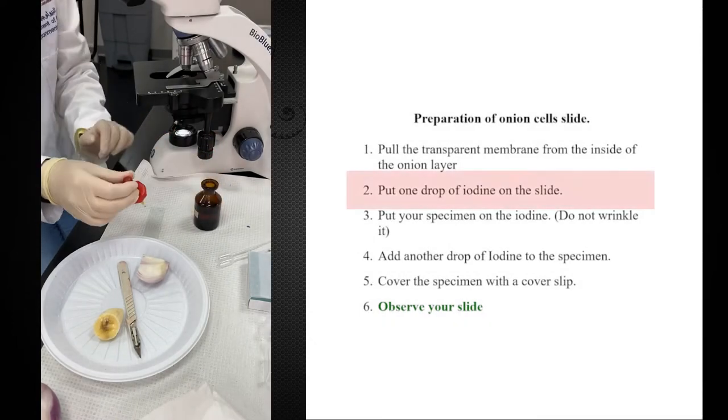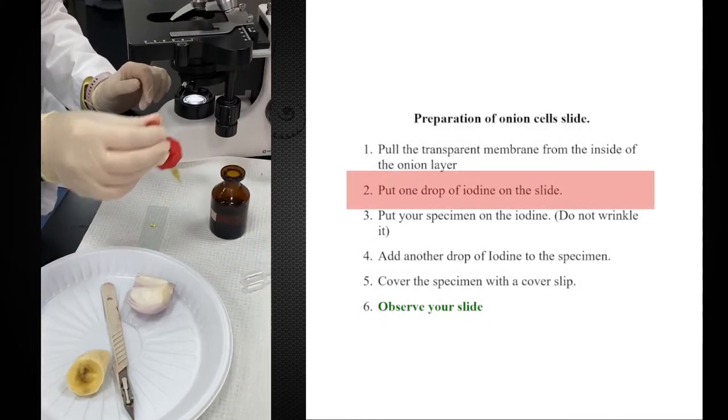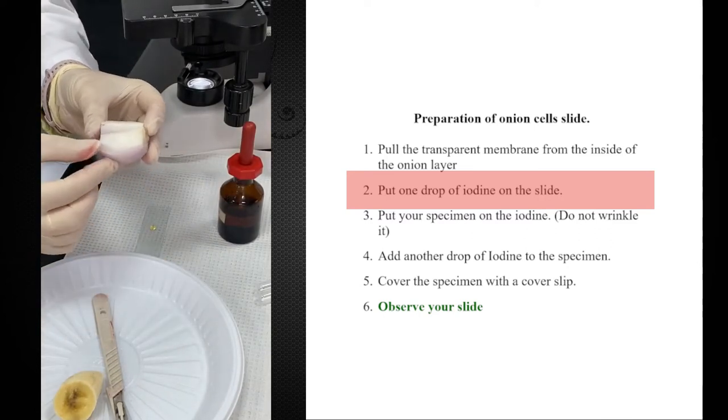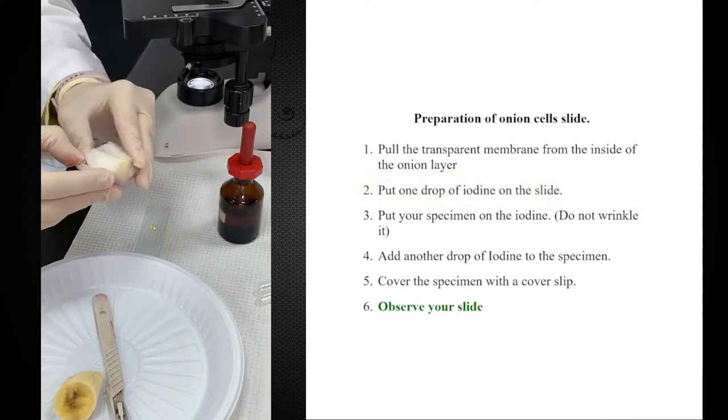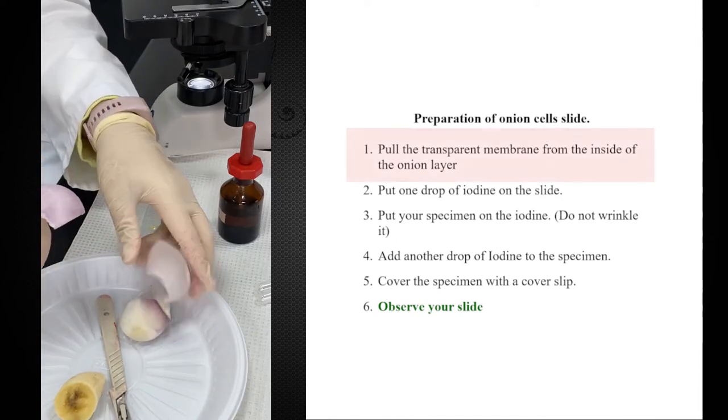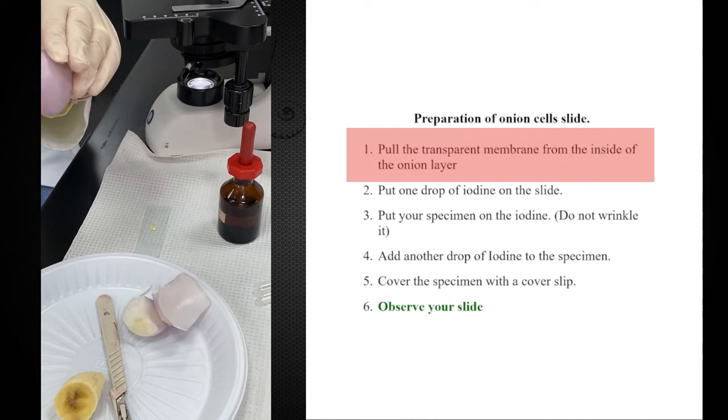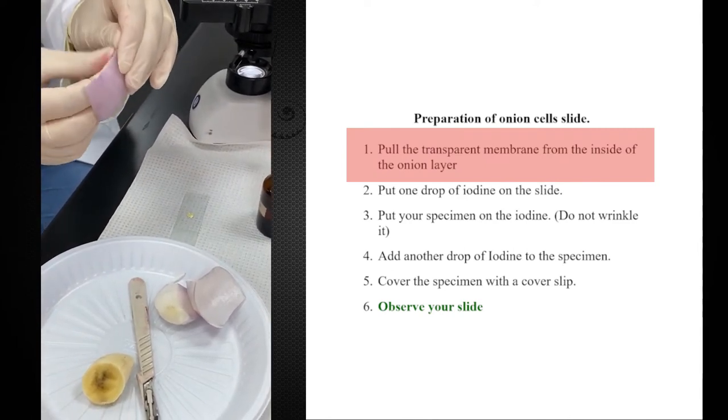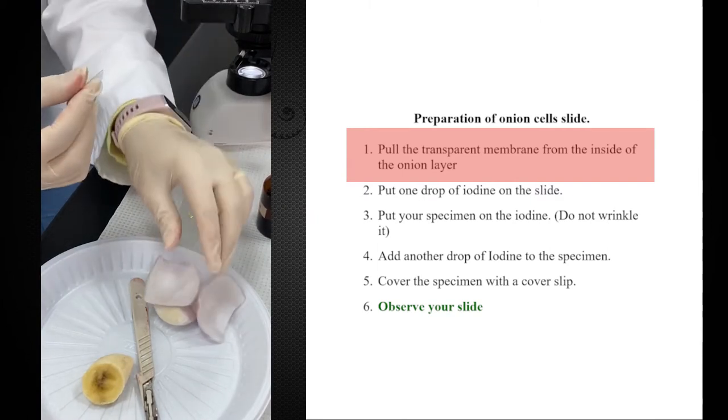To prepare an onion slide, I'm going to use iodine to give the nucleus some color. I will skip the first layer of onion and take from the second layer. I will take from the white side. You can take from the purple side; it will show colorful cells, but I want to show the nucleus, so I take skin from the non-colorful side.